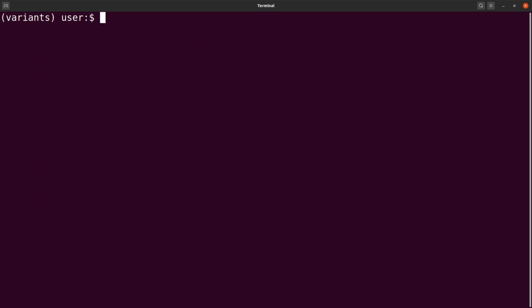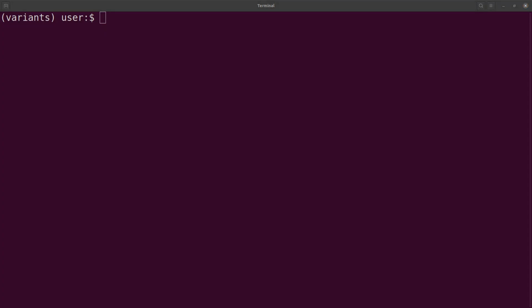The next thing we are going to do is what we call the mpileup. Okay, so we are going to use BCFTOOLS to do the mpileup. So the mpileup is used to generate coverage information for the bases that we have mapped. So this information is used by BCFTOOLS to calculate the genotype likelihood. Okay, so after that, we now do the variant calling itself.